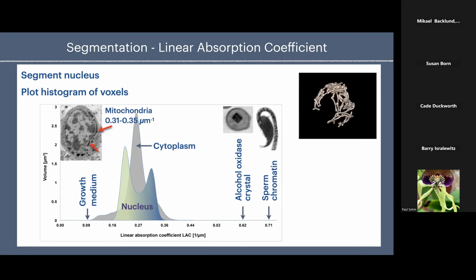Is this in the log? Exact phase it's in. Okay. This one is not post-mitotic. That one I do know. It's pre-mitotic. It's from tissue. Yes. So amazing images. I was curious whether it's possible to look at the DNA within the mitochondria.